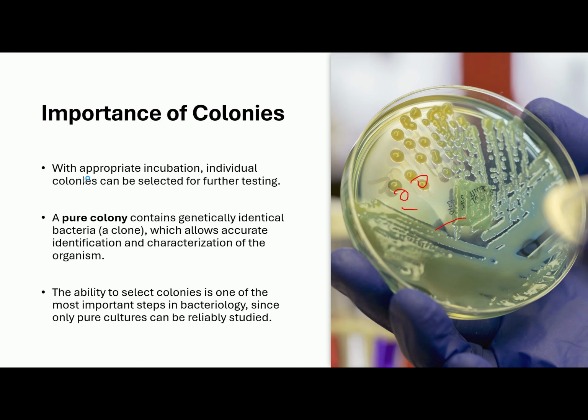A pure colony contains genetically identical bacteria, which allows accurate identification and characterization of the organism. The ability to select colonies is one of the most important steps in bacteriology, since only a pure culture can be reliably studied.